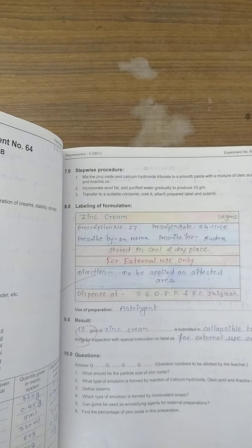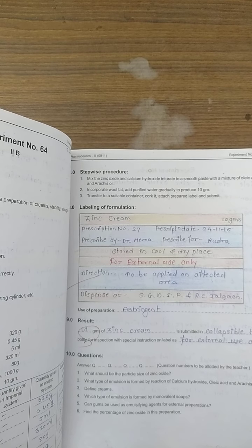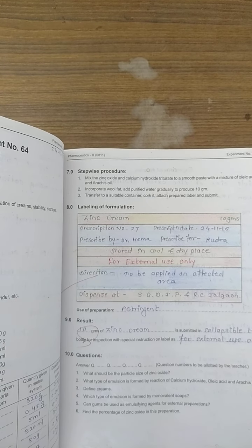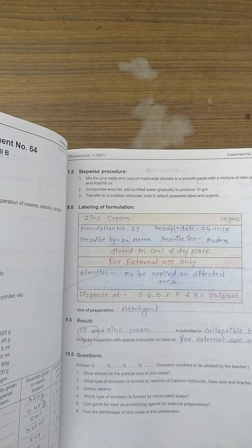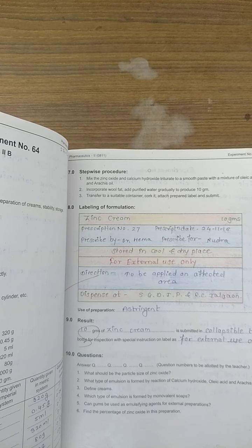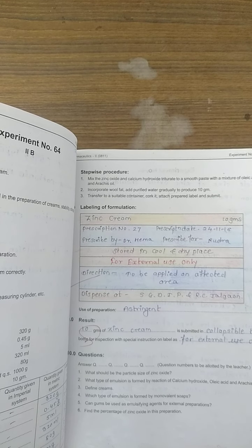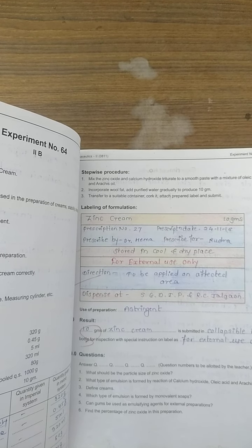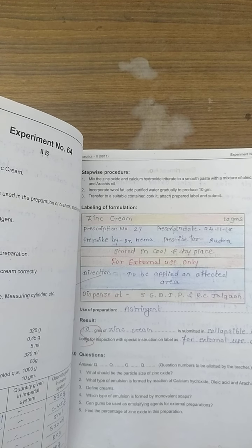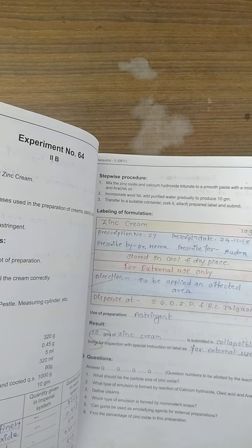In the procedure, we select zinc oxide and calcium hydroxide and make a smooth paste. Then add the mixture of arachis oil into the oily phase. Gradually add wool fat and purified water to reach 10 grams. Transfer to the bottle, label it, and submit it. We use zinc cream as an emollient. 10 grams of zinc cream is submitted in a collapsible tube or bottle.